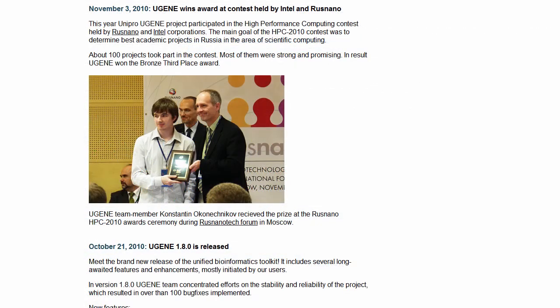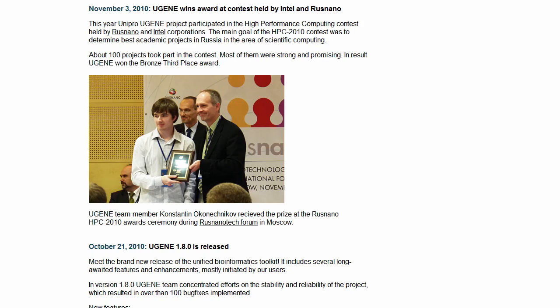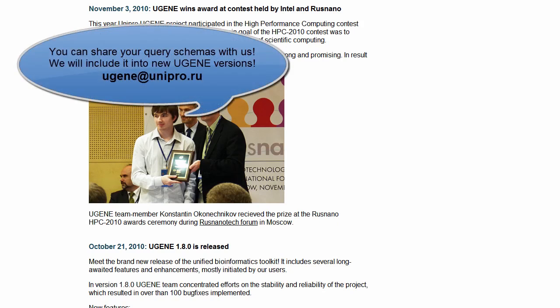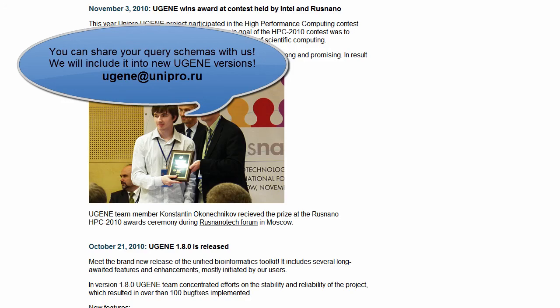This is the way to work with the query designer. You can create your own query schemas matching your needs. If you do so, we would be glad if you share it with us by email ugene at unipro.ru and help us improve our product by including your schema into future UGENE package versions.